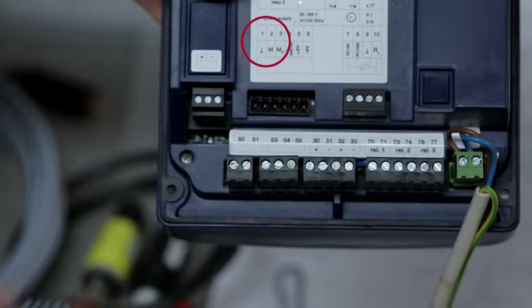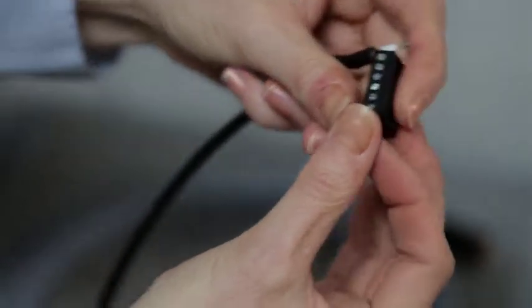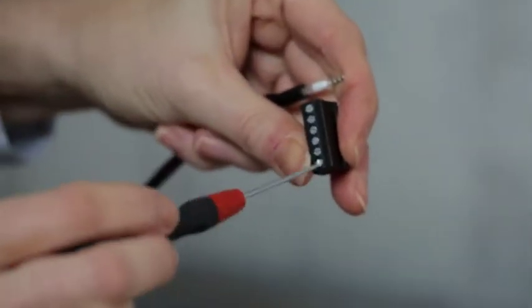Connect the pH sensor to terminals 1 and 2. The reference electrode, screen, is assigned to terminal 1.